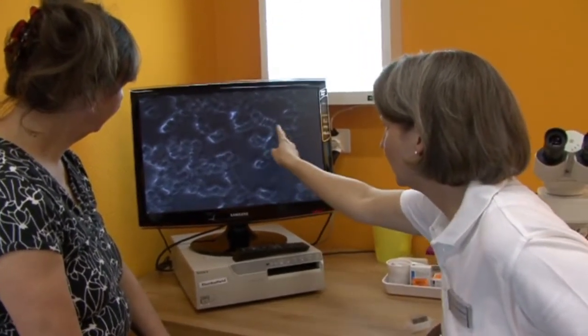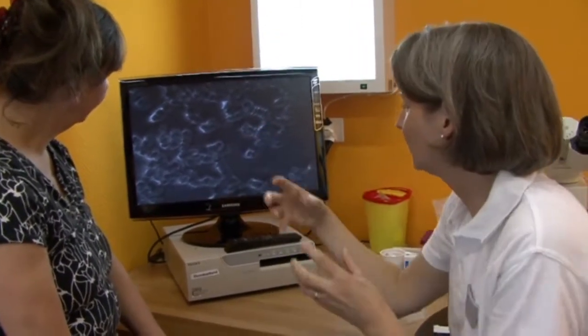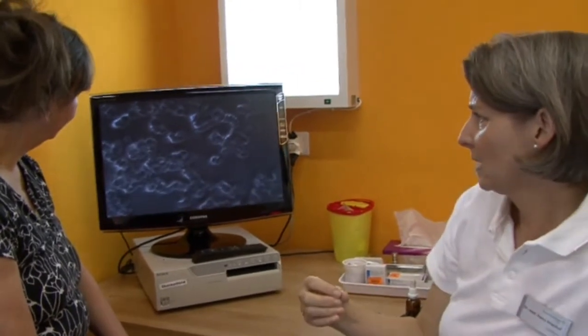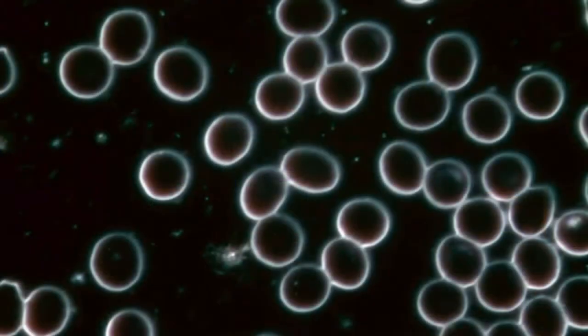As you can see here, the red blood cells are stuck into each other. It is very important for the flow function of the blood that the red blood cells are clearly separated from each other and, considering the high membrane tension, have good actions.